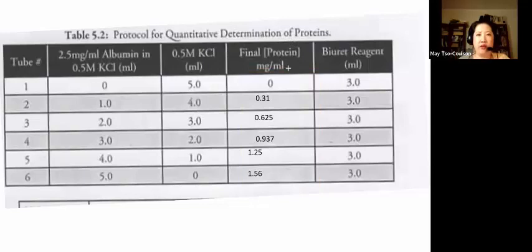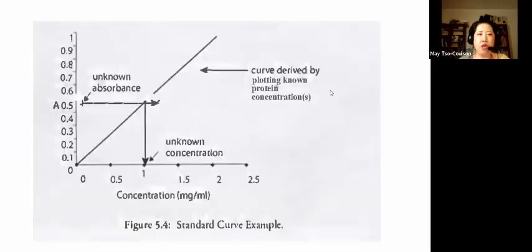We can then plot a graph similar to the one shown here. We can plot a line graph and do a best fit line such as is shown here.